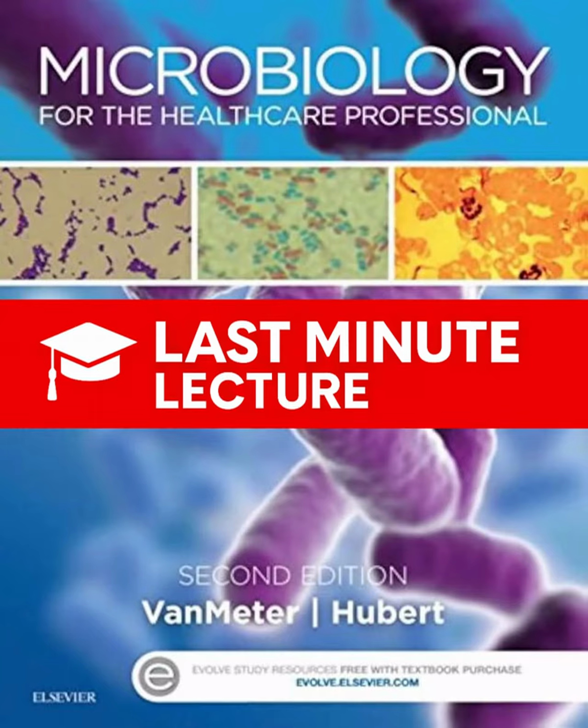And the opposite is a negative stain. Kinda, yeah. Negative stains use acidic dyes, which have a negative charge. Since like charges repel, the dye doesn't stick to the negatively charged bacteria. Instead, it stains the background dark, so the bacteria appear as bright, clear spots against a dark field, like a halo effect. It's neat because you usually don't need to heat fix, which can distort delicate structures. Good for seeing capsules or really thin bacteria like Spirochetes.